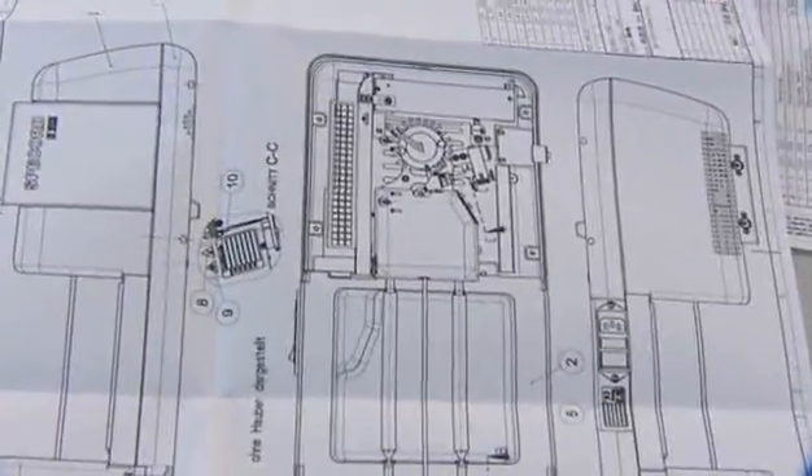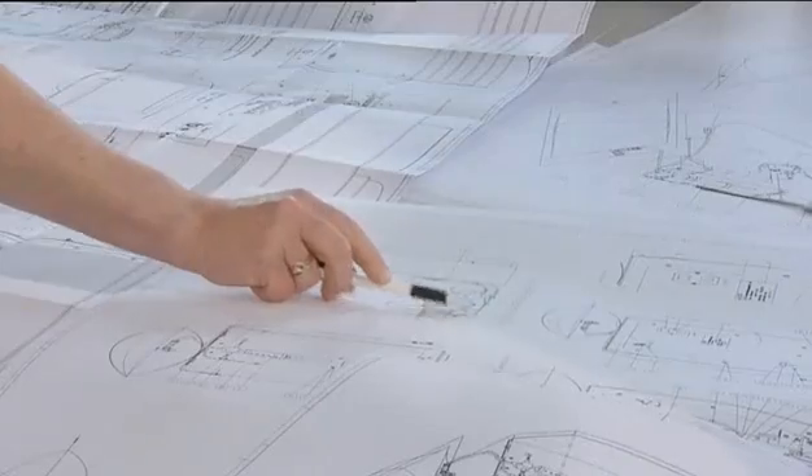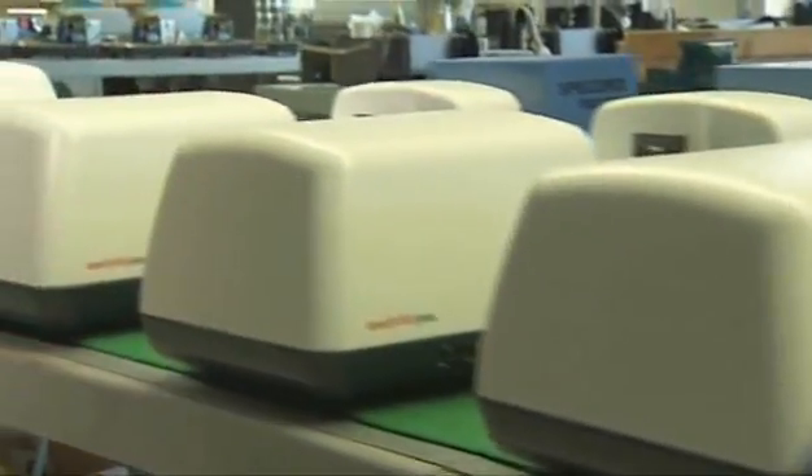Spikort S600 is a simultaneous high-performance diode-array spectrophotometer with a spectral range from 190 to 1,100 nanometers. It combines the precision and convenient handling needed in laboratories with speed, reliability and superior optical performance.